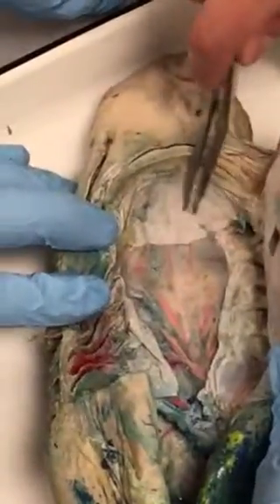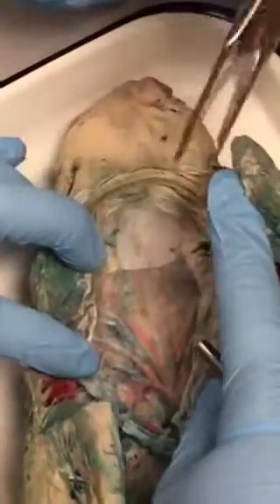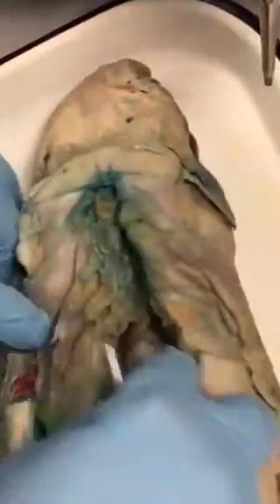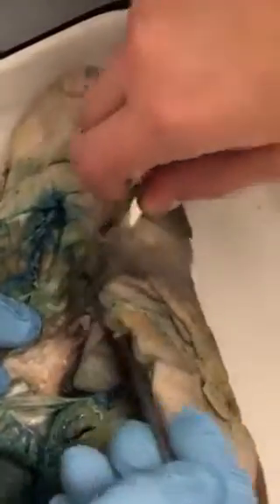Efferent branchial arteries. Okay, that is these red ones here on the roof of the mouth. And I didn't find the other ones. The afferent ones come off of the ventral aorta, so maybe that's these little guys. They branch off, so that could be these ones, these things that branch off, these little red ones that go into the gills.